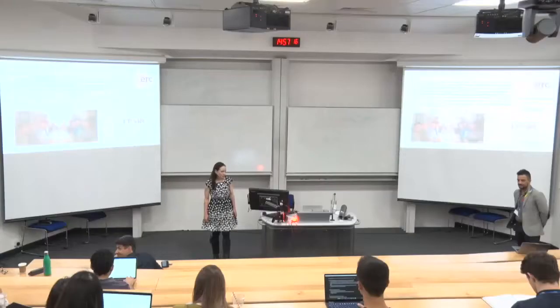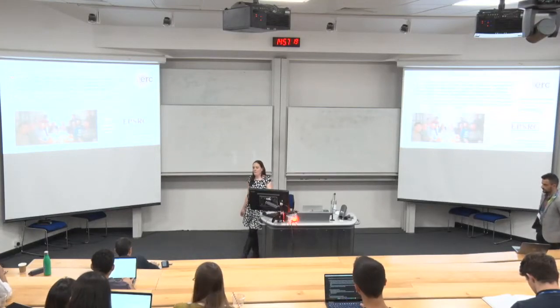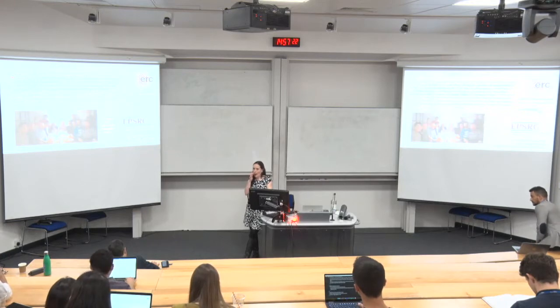Thank you, sir. I had a question on the double-edged sword of looking at very small scales versus a statistical representation of phenomena. Often in scattering, we think of that as a kind of compromise that we make. We look at large sample volumes or areas, and we do that in reciprocal space, so we pay that price. But at least we sample many moles, so to speak, of molecules that can then allow us to do some statistics. And it struck me that in this case you get immense local resolution, but presumably also will be affected by the stochastic variability, right?